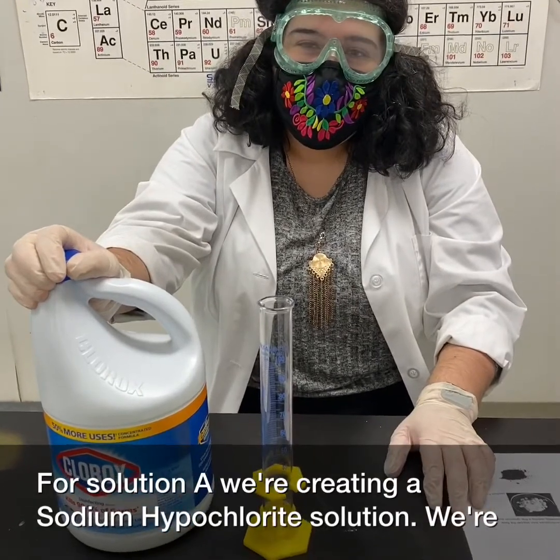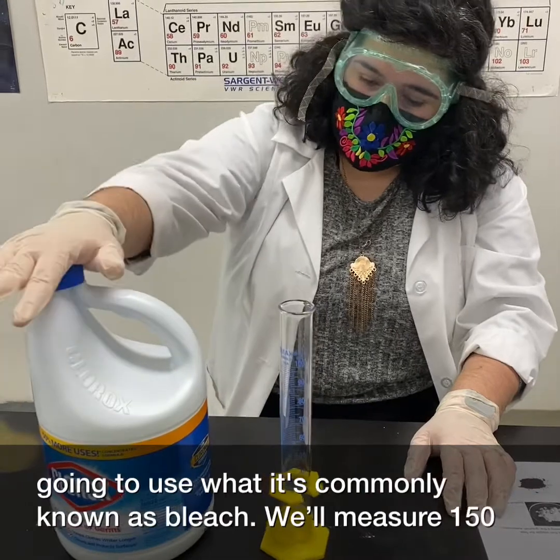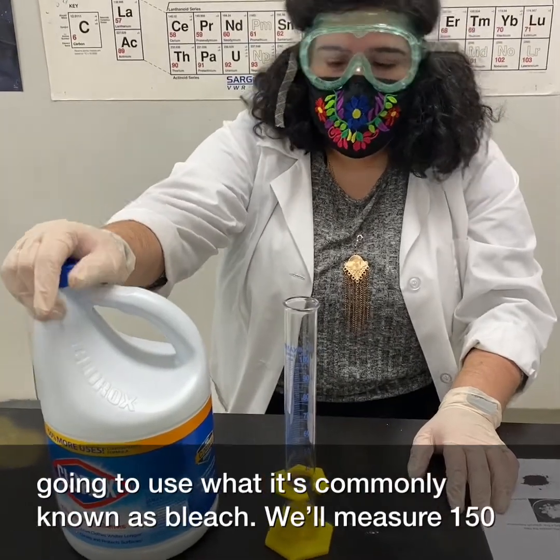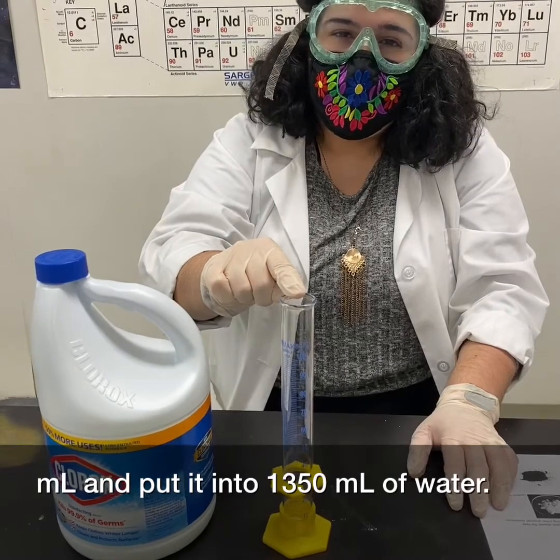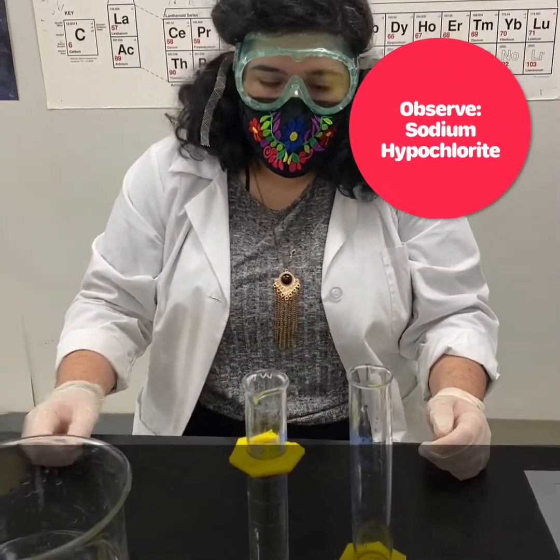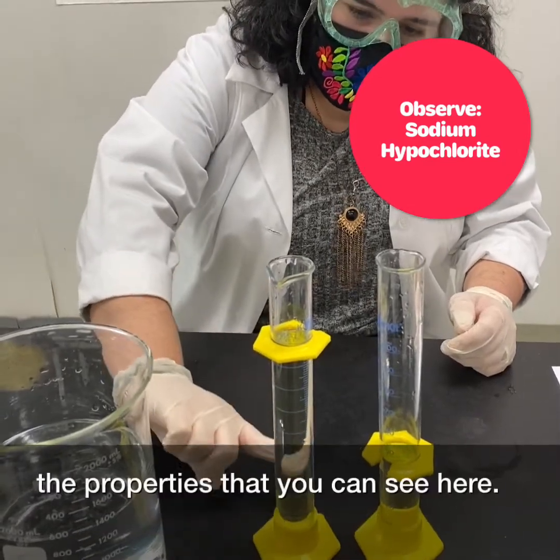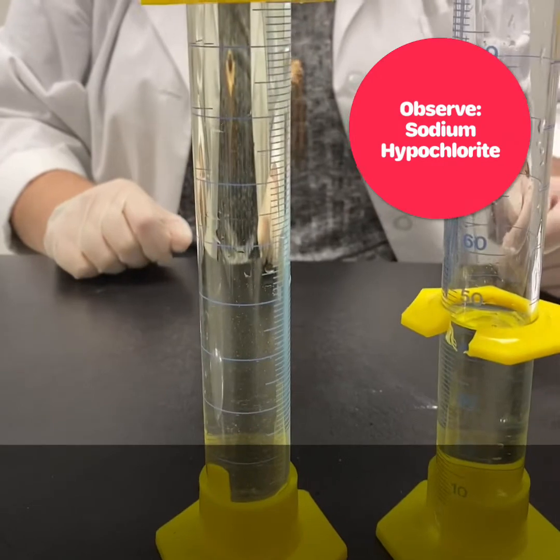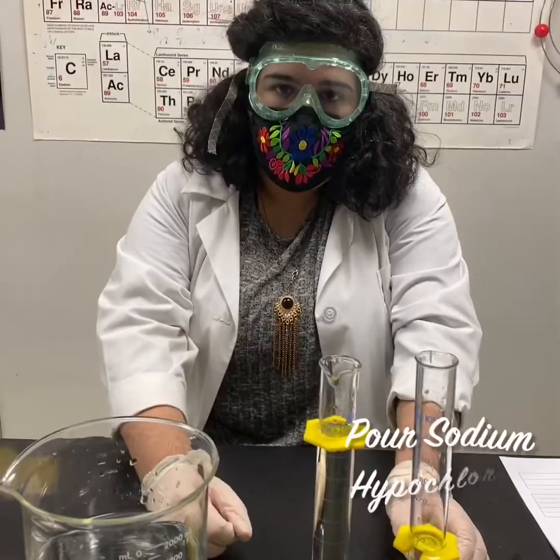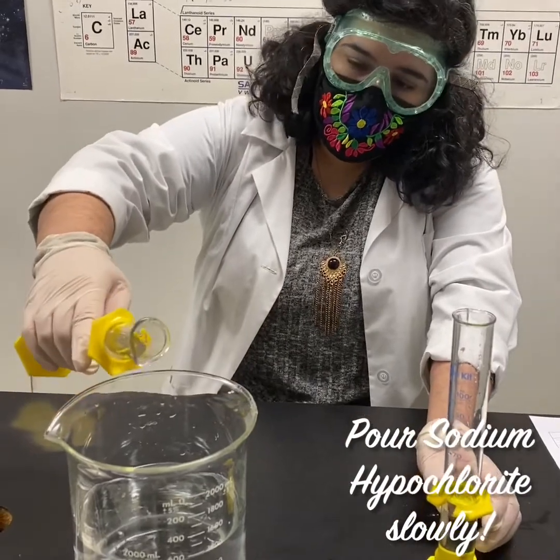For Solution A, we're creating a sodium hypochlorite solution using what is commonly known as bleach. We'll measure 150 milliliters and put it into 1350 milliliters of water. After measuring out your sodium hypochlorite, observe the properties you can see here, then make sure to add it slowly into your water.